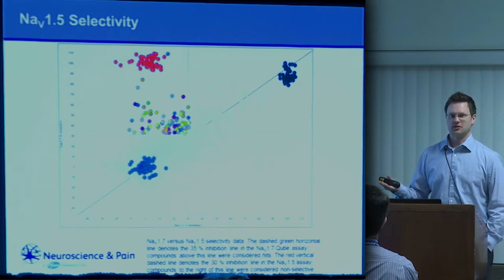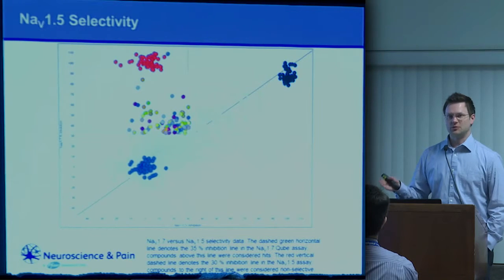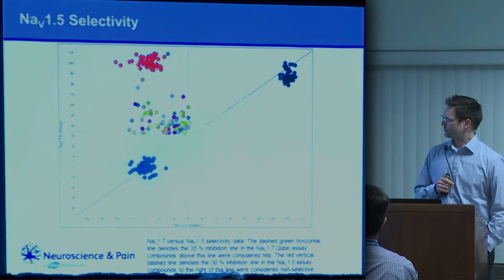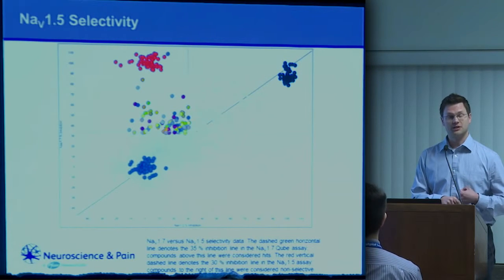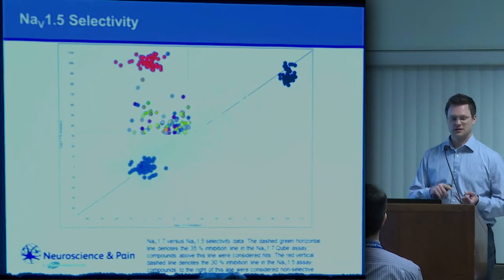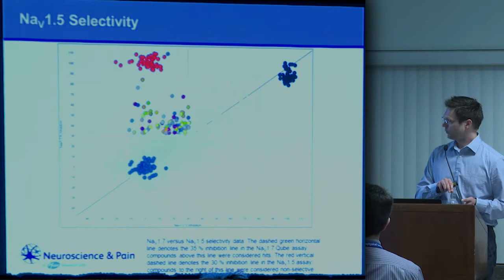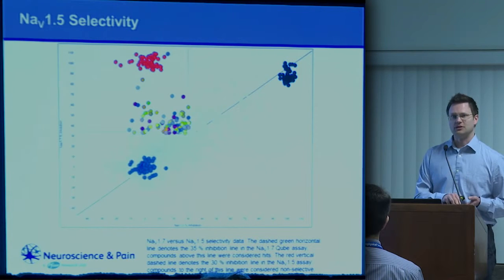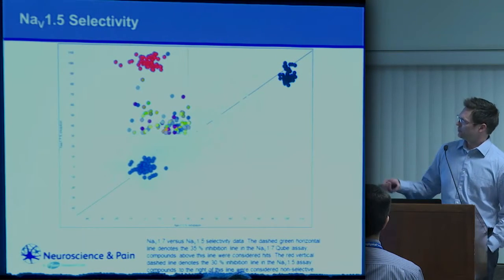All right, so why is that not 100? Typically in HTS campaigns, you never get a 100% repeat rate. That's nearly impossible. So it's likely that we still had some artifact responses in our initial HTS data, which were picked as hits. The compounds also came from different sources. So these were not the same compound plates. They came from a different place in India, where they were pre-prepared for us. And it's also possible that we had some precipitation issues. But back to the point of the graph.